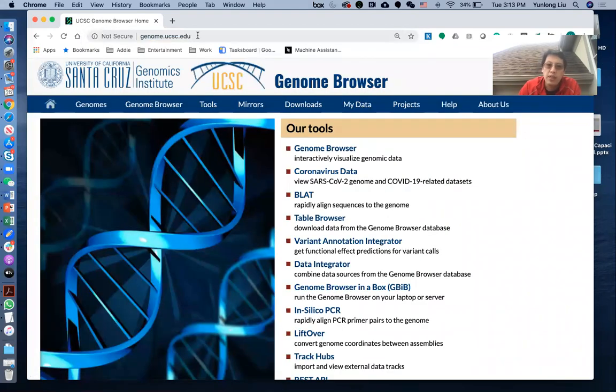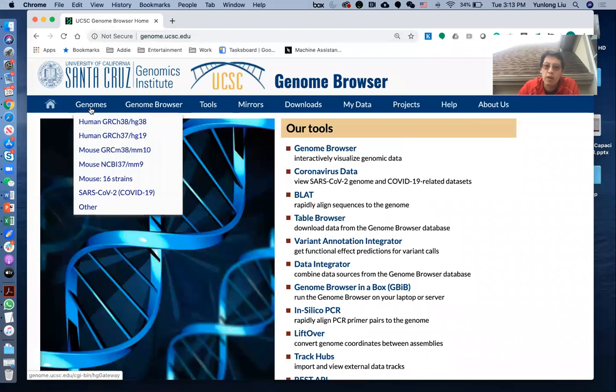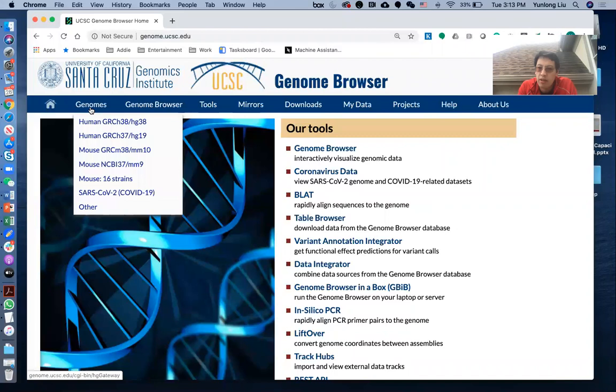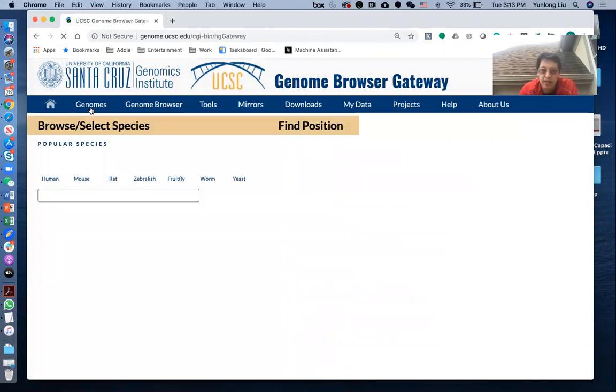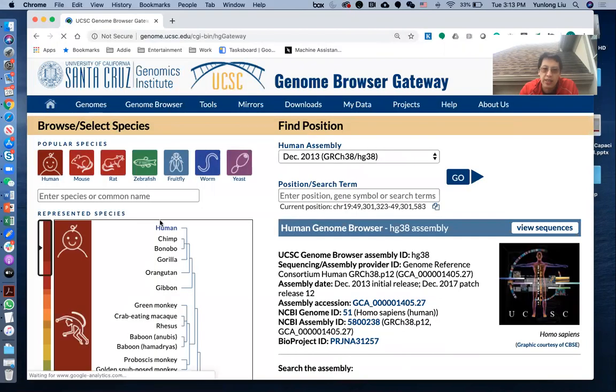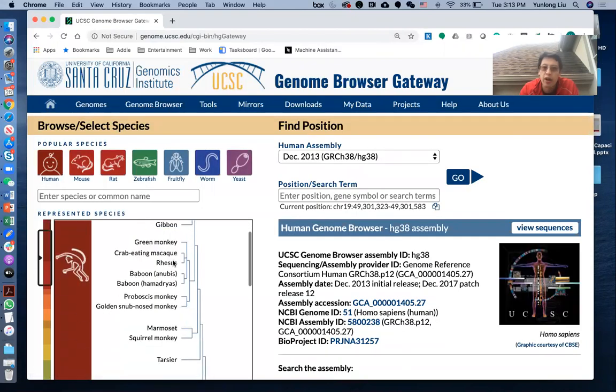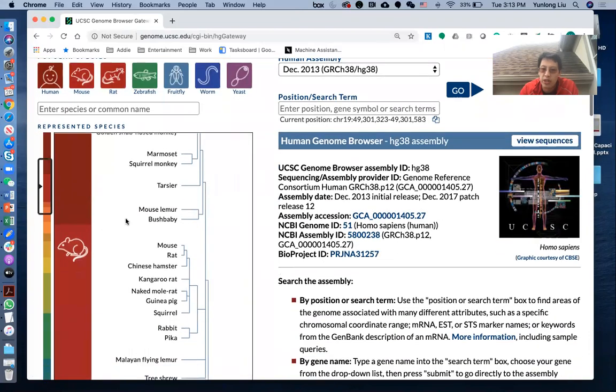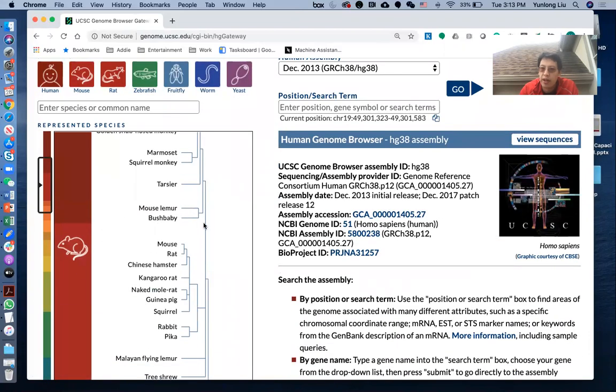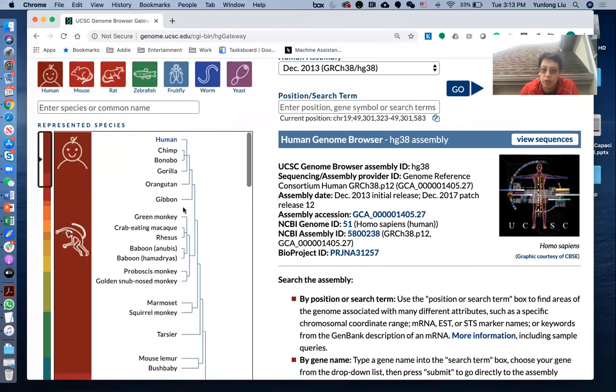Once you get there, you hover into this Genomes button, and you will see that there are several different charts coming out. That will include human, mouse, and other species. If you click this in, you can see actually there are many more species that are available for you to choose from.